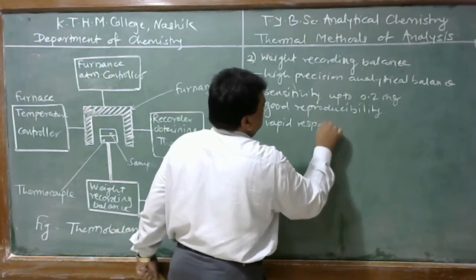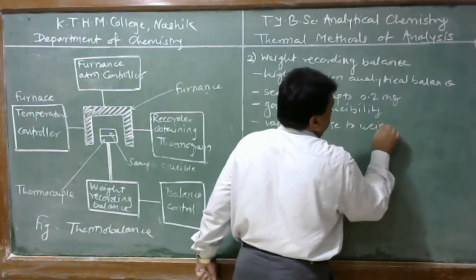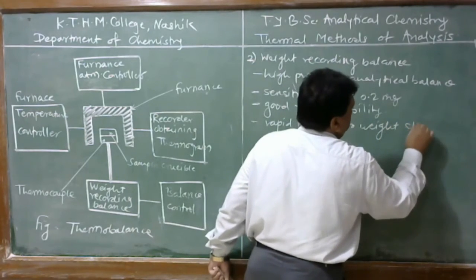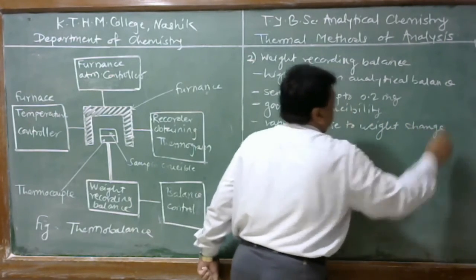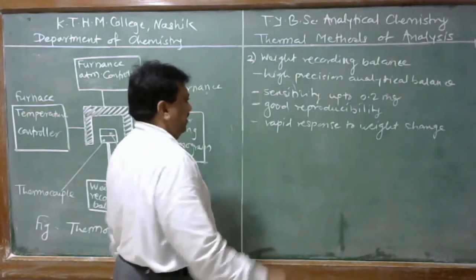It gives a rapid response to weight change, so that the change in weight can be recorded at that temperature.